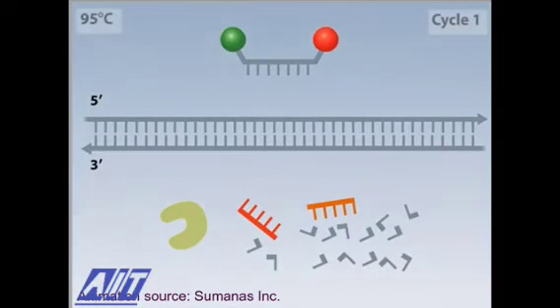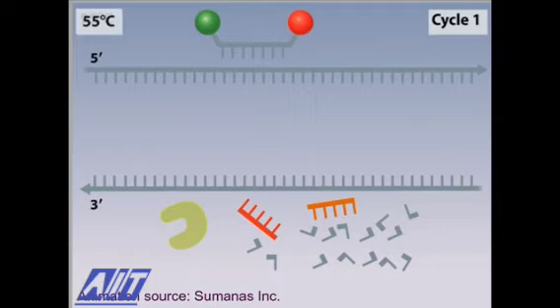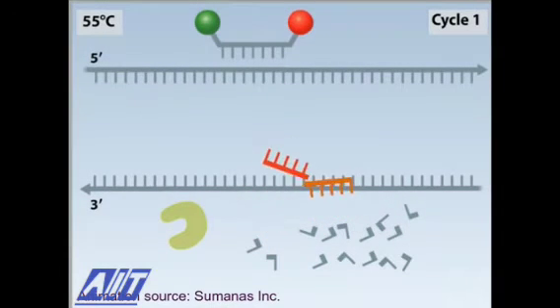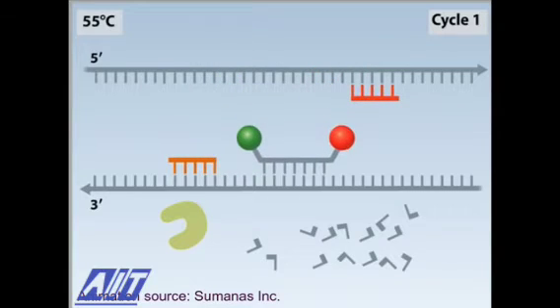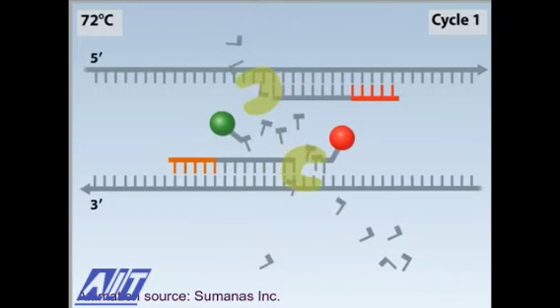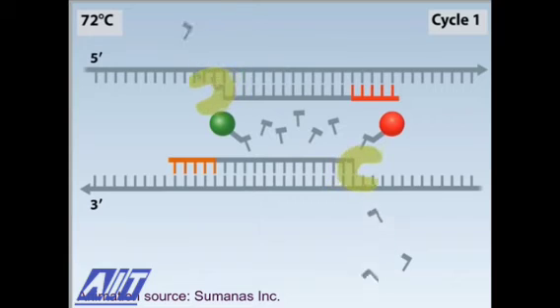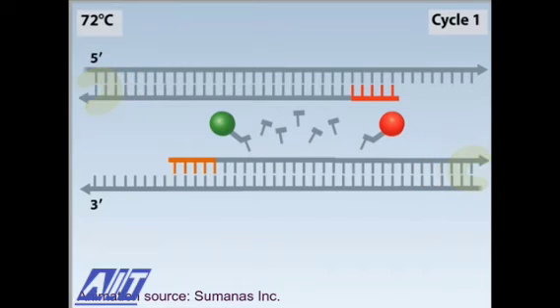The probe participates in the PCR cycles, which begin with the heat denaturation of the DNA. The temperature is then lowered and the probe and primers anneal to the specific sequence on the DNA strands. Taq DNA polymerase synthesizes complementary DNA using the primer as a starting point. When the polymerase encounters the probe, it isn't actually blocked. The polymerase has a 5' to 3' exonuclease activity that it uses to digest the probe. At the same time, the polymerase continues to elongate the new DNA strand.